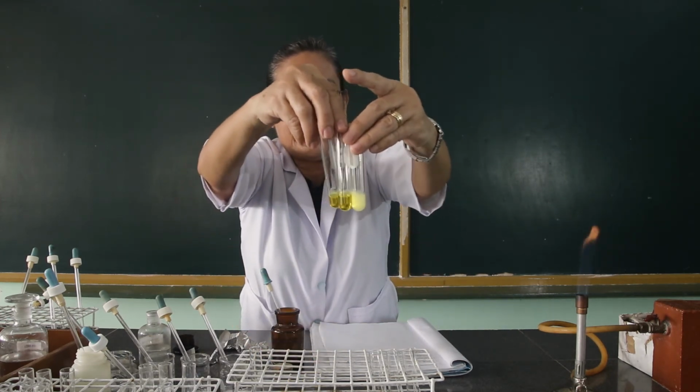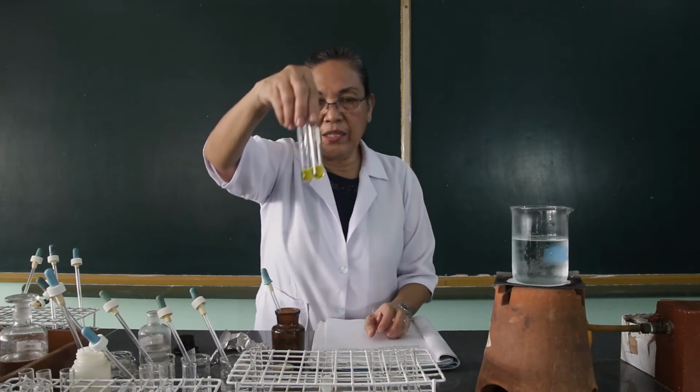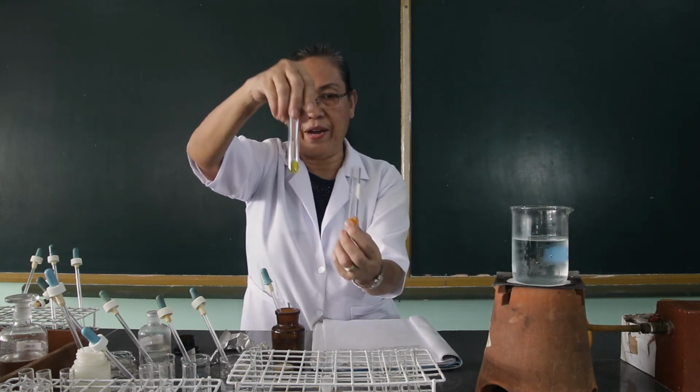Observe what happens. So, from the result, this is the calcium chloride and this is the strontium chloride.